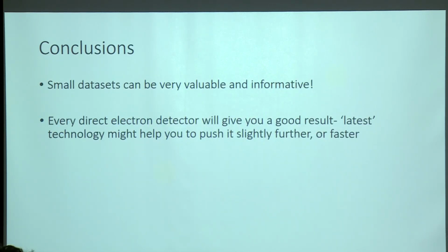So the takeaways from this section: the new detector technology coming out, particularly the Falcon 4 that we've just had installed in Leeds, is just amazingly fast, and I think it presents us with a whole set of new challenges in terms of how we make the most of our cryo-electron microscopy technology, how we make the most of the infrastructure that we have available to us.